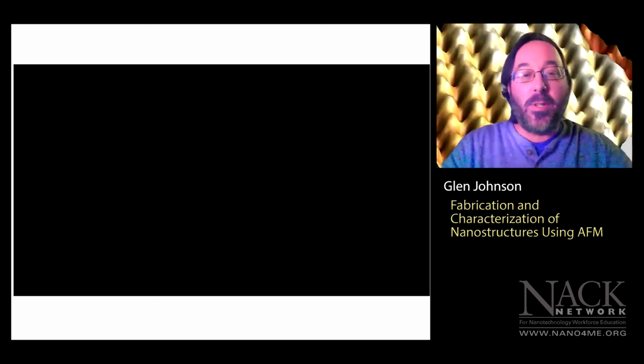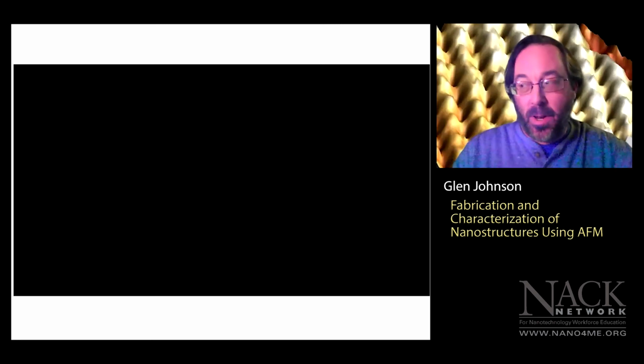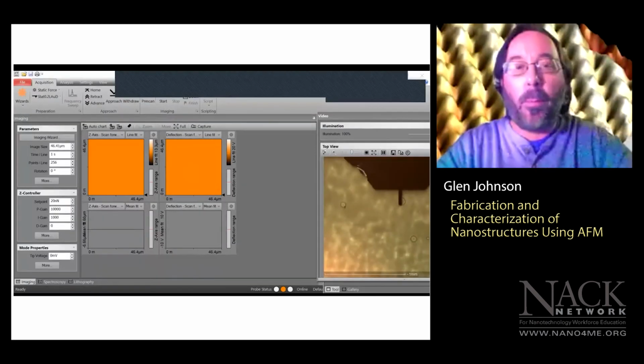Okay, so I'll move on to show you what our other microscope looks like. The one I just showed you is in our lab and it's not online. So we're not able to use that one remotely, which is why I made videos and shared those. The one that I have now, it's similar to another one in our lab, but it's portable. So I'm in my basement right now and we will see if it will behave for us. But this is what it's going to look like when we open it up.